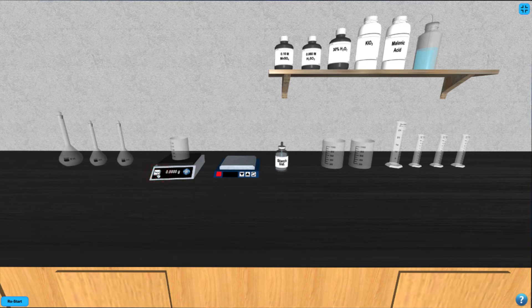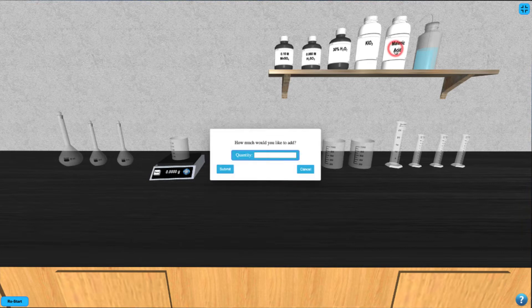Next, click on the malonic acid bottle and enter the mass of malonic acid you wish to add into the beaker in units of grams, and record the mass of malonic acid from the balance.